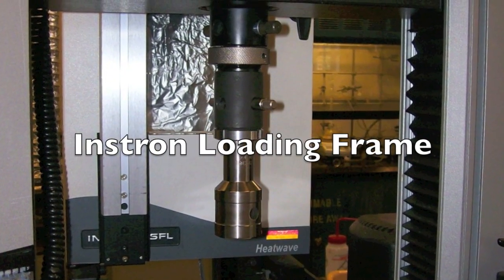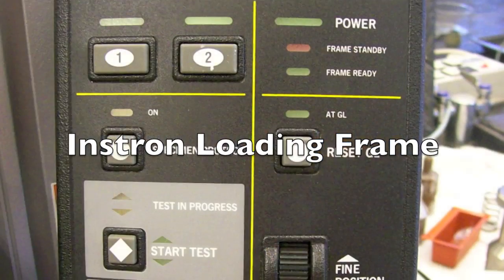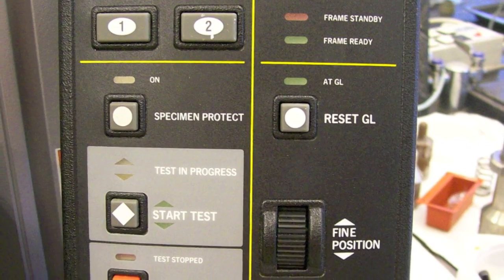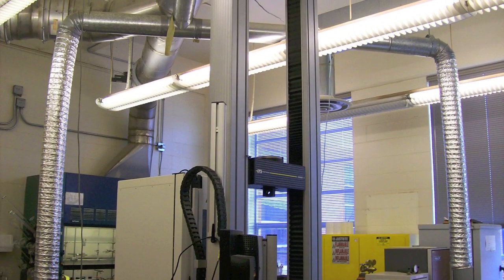The Instron Load Frame is used for tensile and compressive mechanical testing of materials. Other types of tests include shearing, bending, and cyclic loading.